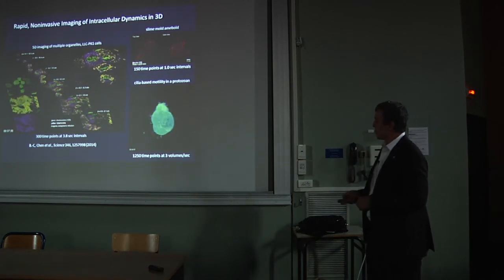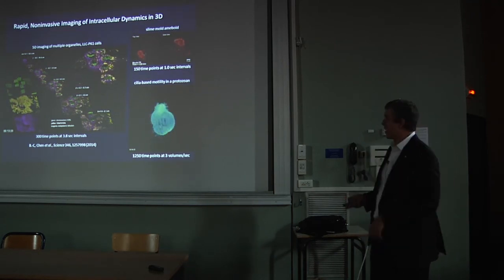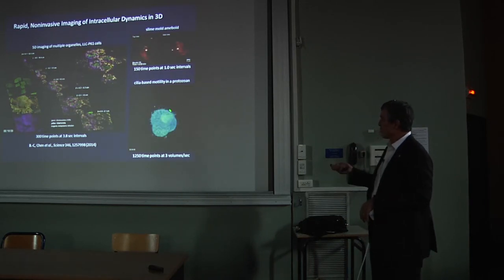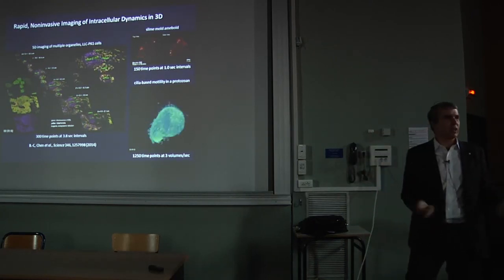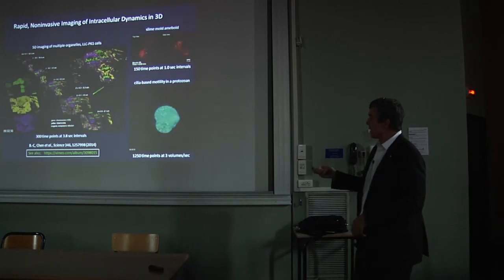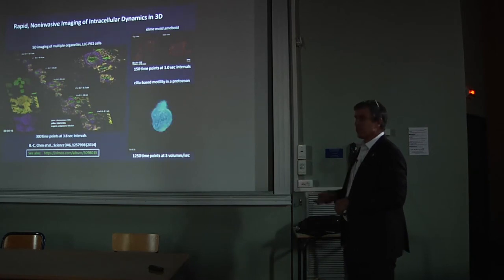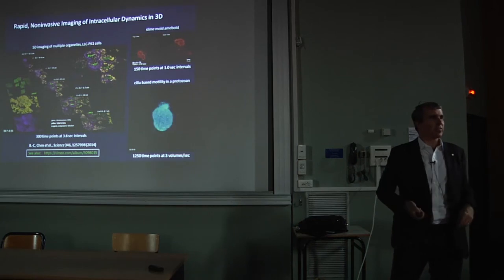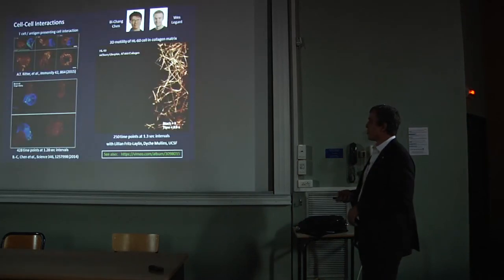Here's yet another example, Tetrahymena. It's a protozoan like you'll find in the pond. In this case, it's trapped inside of a pocket of agarose, and he's sort of frantically trying to get free for over 1,000 time points, and again, no damage to that specimen, no bleaching to that specimen. If you like these movies, this paper came out last year in Science. You can also find on Vimeo an album that has about 40 examples of this kind of thing. Or if you just Google lattice light Vimeo, you'll find it right away.